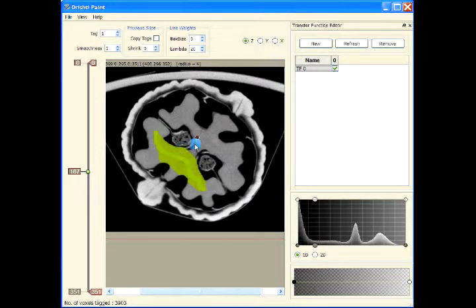So reset. What lambda does is it basically defines how tight, or how close to your originally painted region, your final tagging would be. So now the lambda is 50. Press T and this is much tighter and much smoother. Press reset again, R, and 10, and D, tag. So reset again. Now let us change the box size.